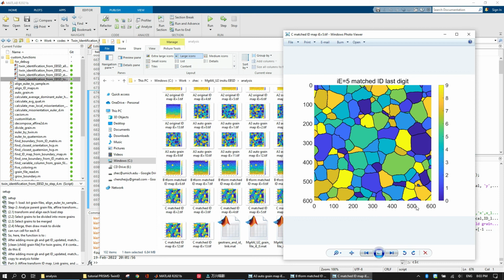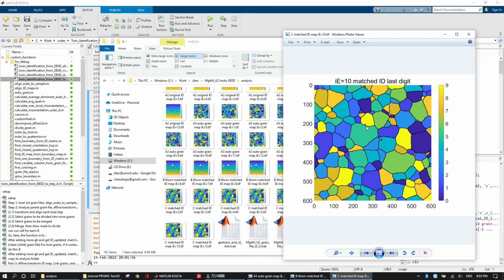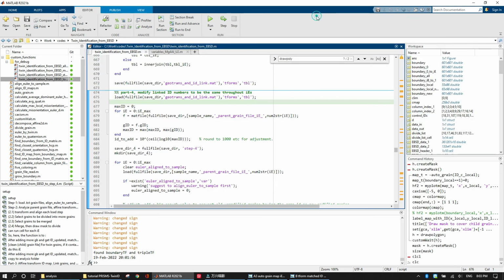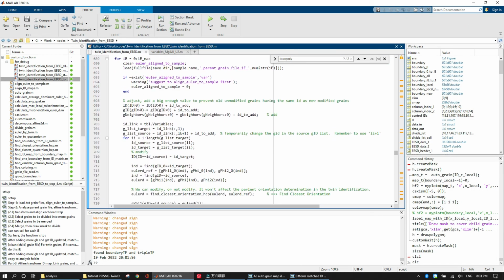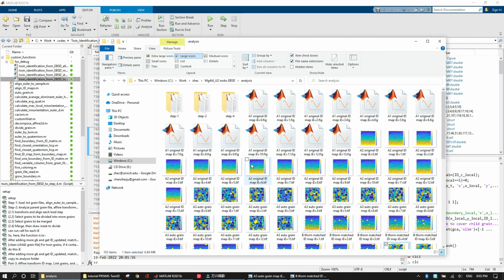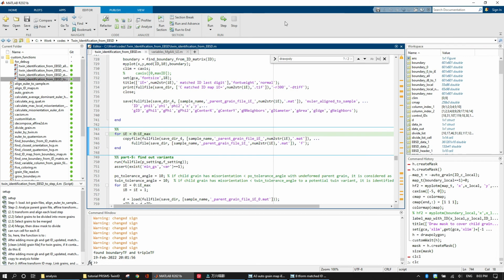There's no good way to correlate them and process them. For most of these areas in the center, we see the match is very good. And this part is done. This does similar things like copying the backup files from the folder after this section to the main folder.